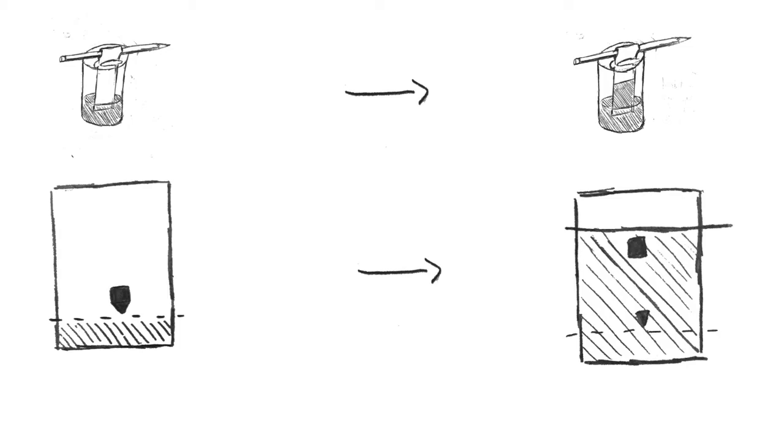You can think of it as when the nonpolar liquid moves upstream, it drags along with it other nonpolar molecules. So, since the square is dragged across the paper more, we can assume that the square is more nonpolar than the triangle, or that the triangle is more polar than the square.